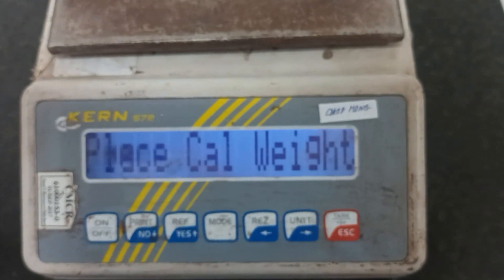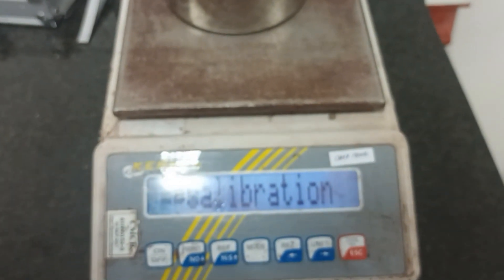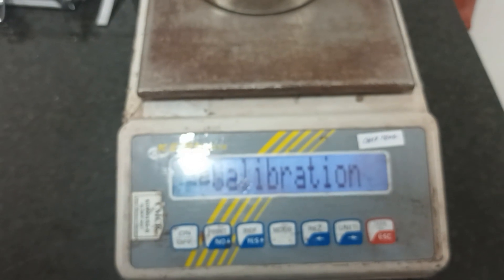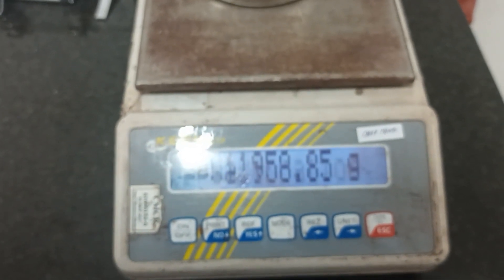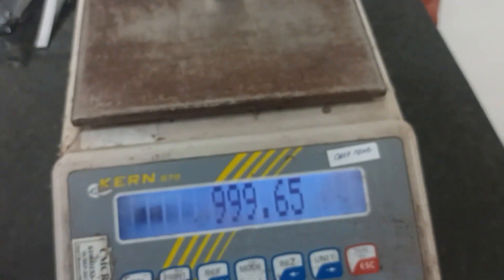I will calibrate the full capacity. Just place the weights on the pan and wait a moment. The calibration is now complete — it passed. I will check the result. That is the calibration.